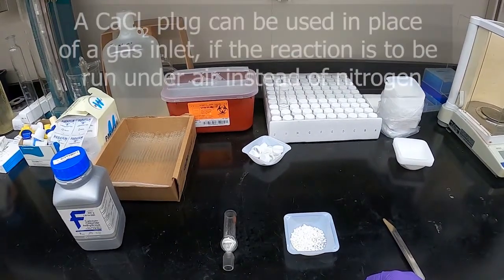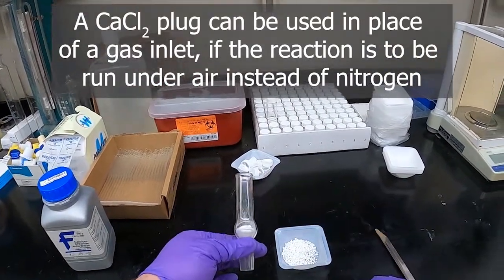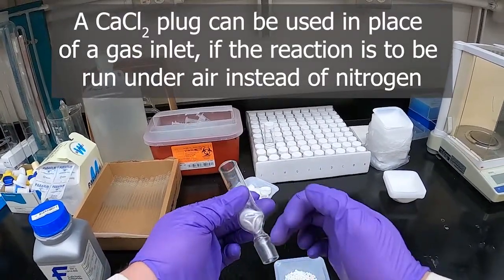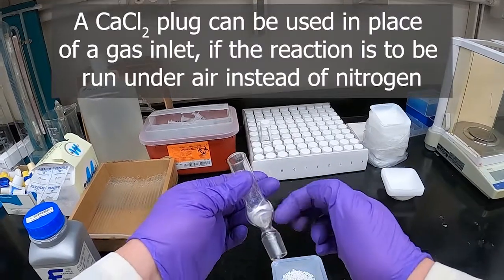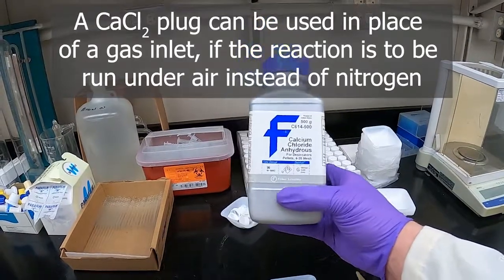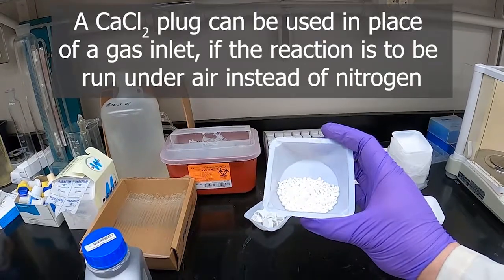So as an alternative to an oil bubbler, in the case where nitrogen isn't available, if you're going to do the reaction under air, you can assemble a calcium chloride plug to prevent wet air from coming into your flask. So you'll need some kind of glassware like this. Angles work as well, just some way that you can stop up the entrance of the piece of glassware with glass wool in this case, to prevent the calcium chloride from getting into your flask. I've already stuffed this with glass wool, and then you'll want to use anhydrous calcium chloride. This one is specifically for desiccators, or in this case a plug. These larger granules are helpful because they don't fall through the glass wool quite so easily.